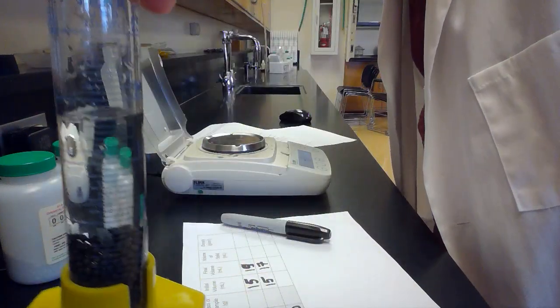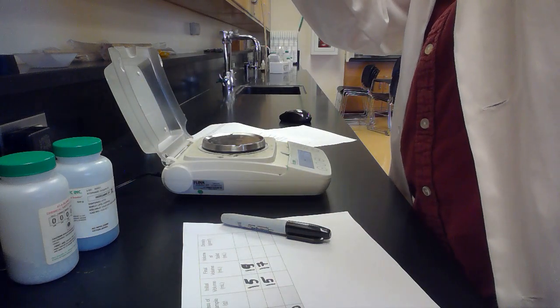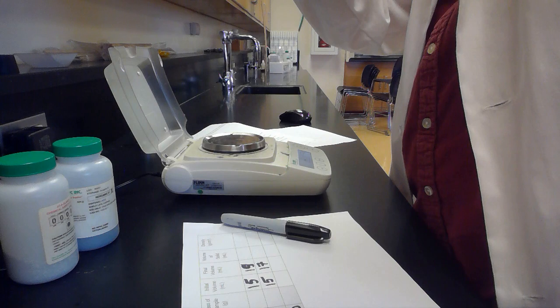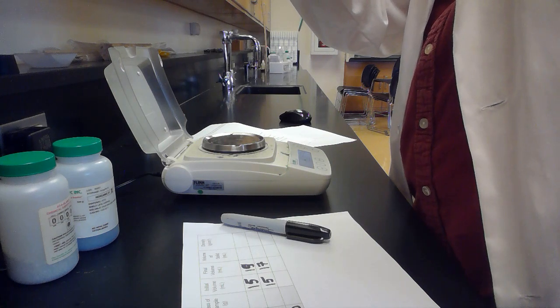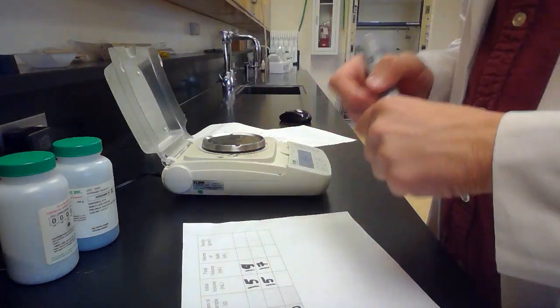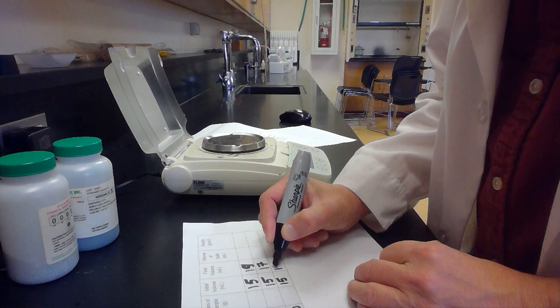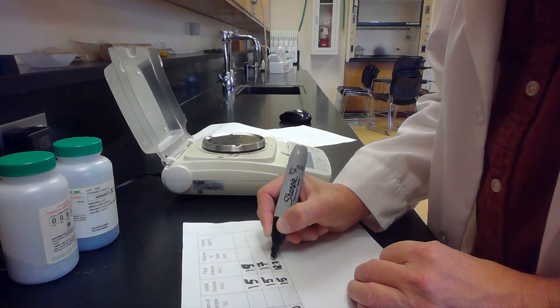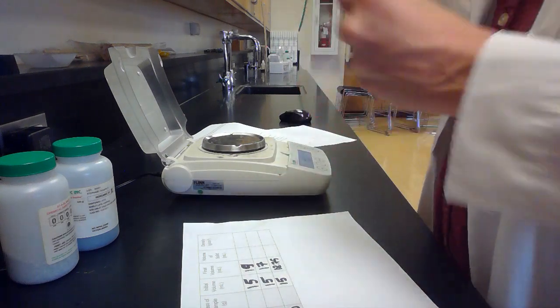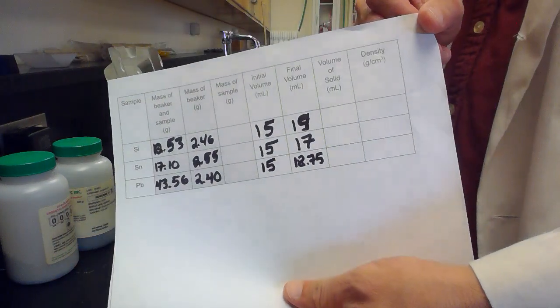You can see the lead's in there, the water level's gone up, and it's now, I want to say that's about 18.75. So my initial was 15, and my final is 18.75. All right, so now we have completed all of the data it asked us to take.